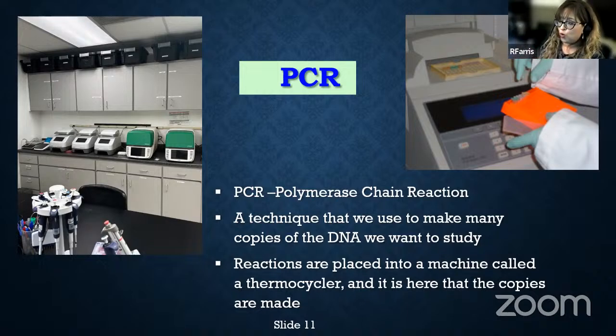And so when we are setting up our PCRs, we hone in to certain sections of the genome by designing our PCRs to encompass certain small DNA molecules known as primers, and they act as targets to certain sections of the target DNA that we're wanting to amplify.